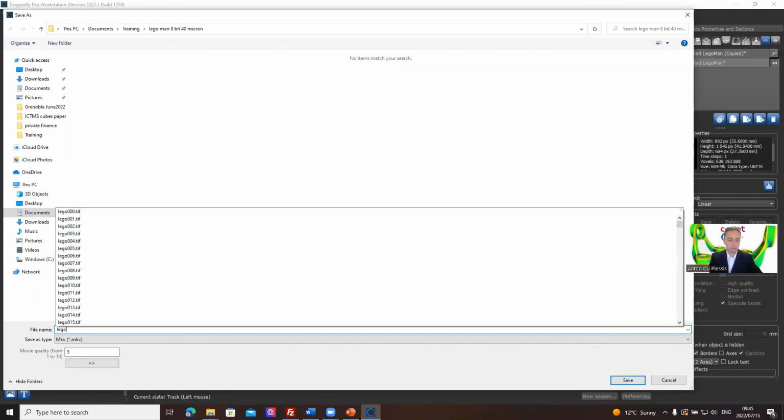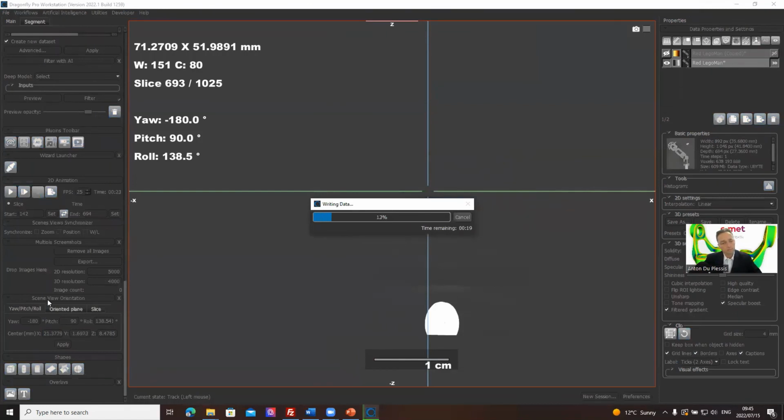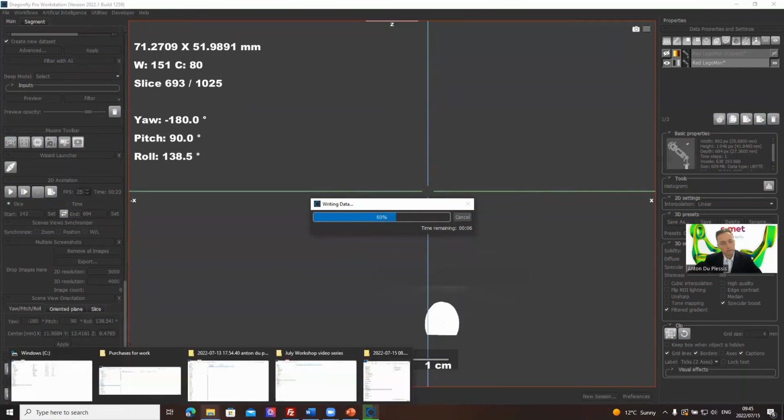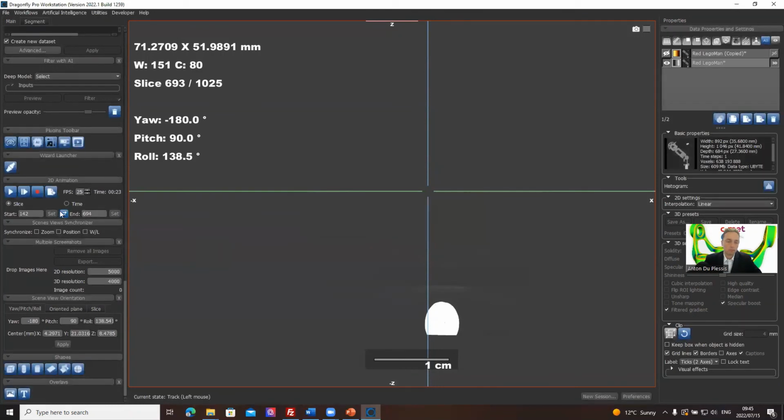And this is now a Lego video. So let's see how that turns out. Okay, so actually I've saved it. I can also just click on the play button to preview it before saving.